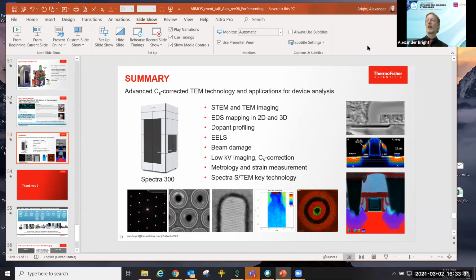So even in non-ideal sites, in many cases we can still get good data. That's true. But at the same time, trying to get the best site you can really does make a big difference to the quality of data and the ease of use.